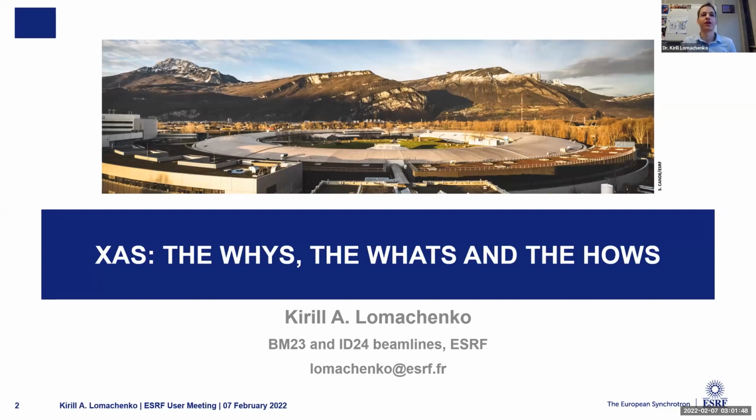This morning I'm going to talk about X-ray absorption spectroscopy. This is going to be a very introductory talk to give a flavor of what it is and why you might need it. It's basically oriented to those who have none or very little experience with XAS. So it's going to be a very basic introductory talk.